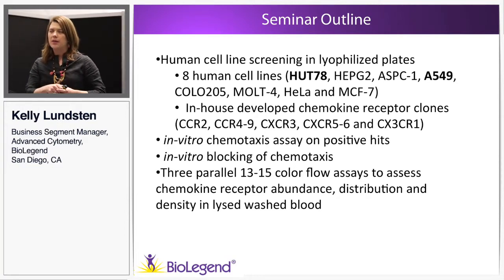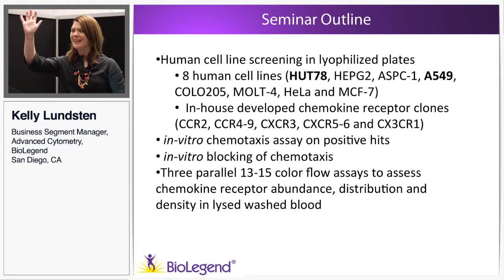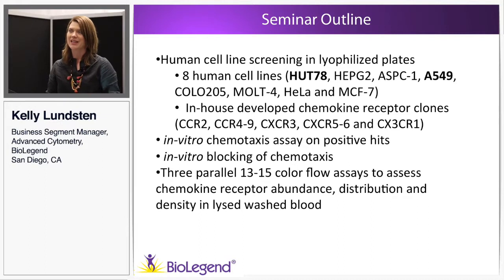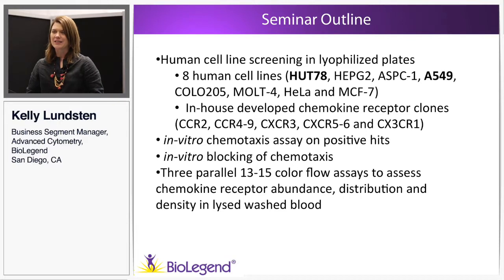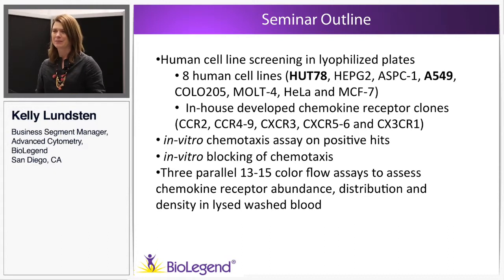Basically, I'm going to show you the ins and outs of the chemotaxis assay. How many of you have ever done a chemotaxis assay or tried to block chemotactic activity before? It was definitely a learning curve. I had a lot of help from our scientists who do this on a daily basis in-house. But there's a lot of variability in these assays. So I'm going to go over the protocol that I followed. It was only a first pass. This is not my primary responsibility. So when I wasn't necessarily getting a blocking effect, it doesn't mean that it doesn't block. It just means the protocol that I used maybe wasn't the most ideal for that particular target. But I will tell you what that is so you can maybe apply that to your research as well.